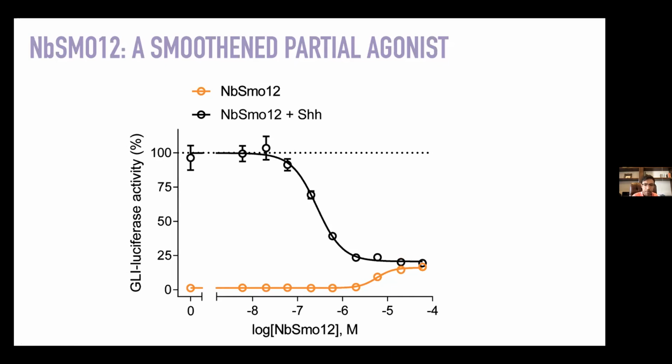And I'll be honest, when Ishan in my lab, working with Brian Faust, another graduate student, wanted to approach this by cryo-EM, I really didn't think this was going to work. And I'll also say that we'd spent quite a bit of time getting a structure of nanobody 12 bound to SMOOTHENED by X-ray crystallography, with a maximal resolution that we were able to attain of about 3.8 angstroms. And well, that was probably good enough. We probably didn't need a better structure than that.